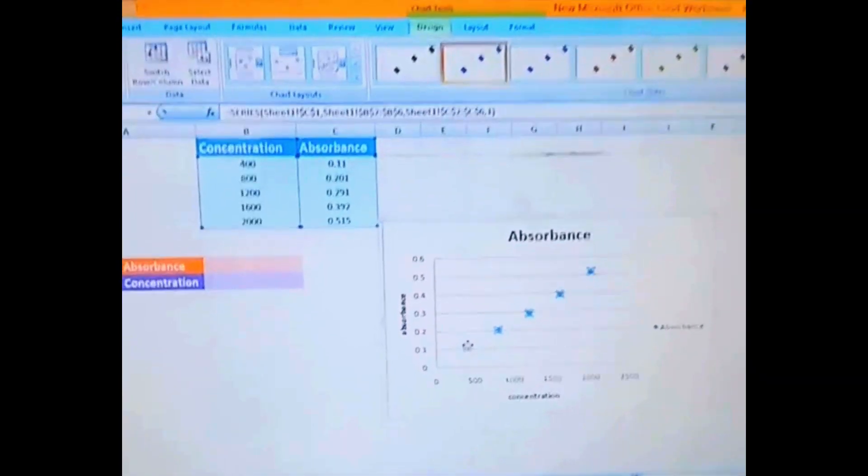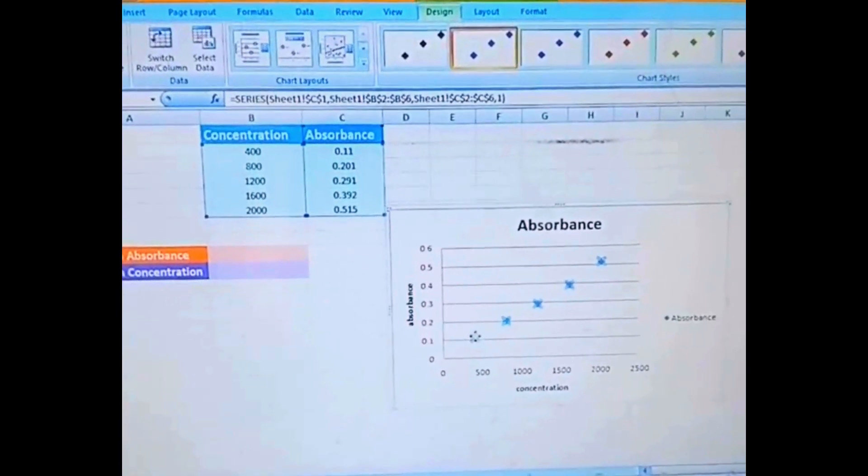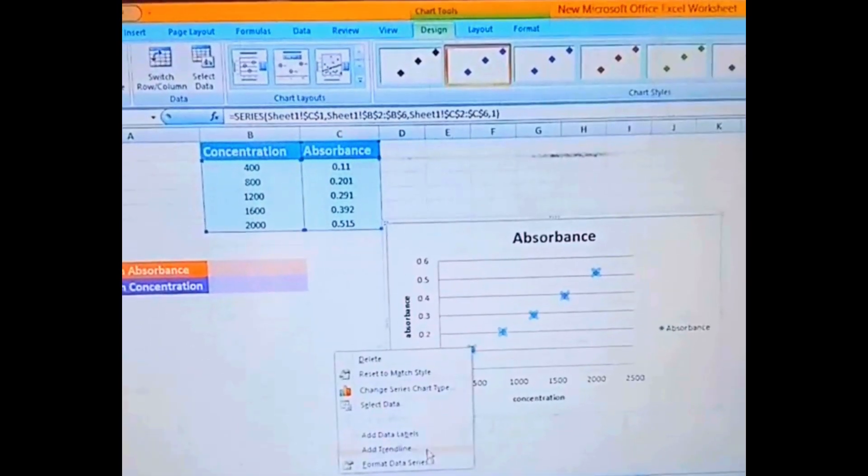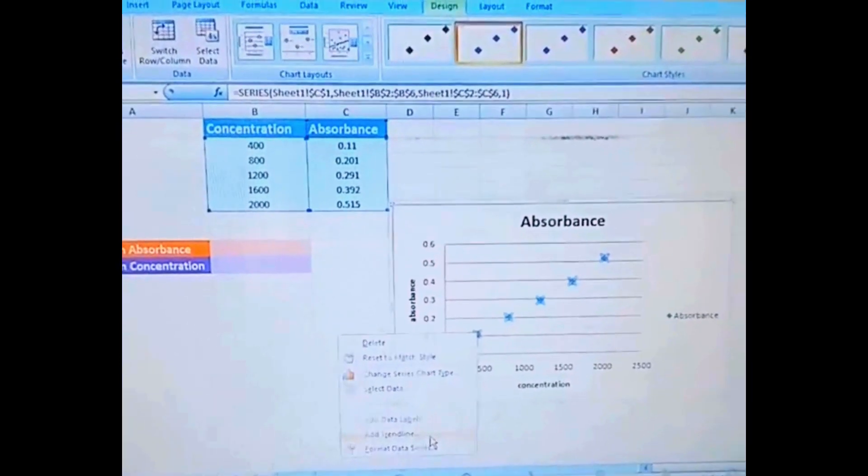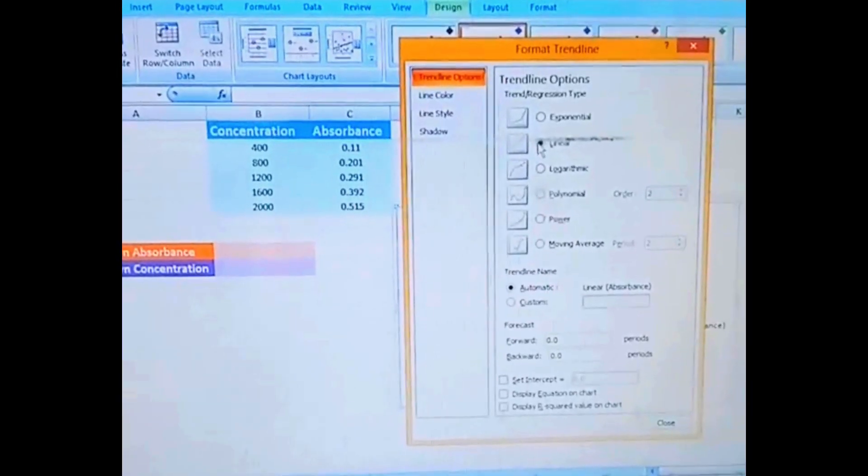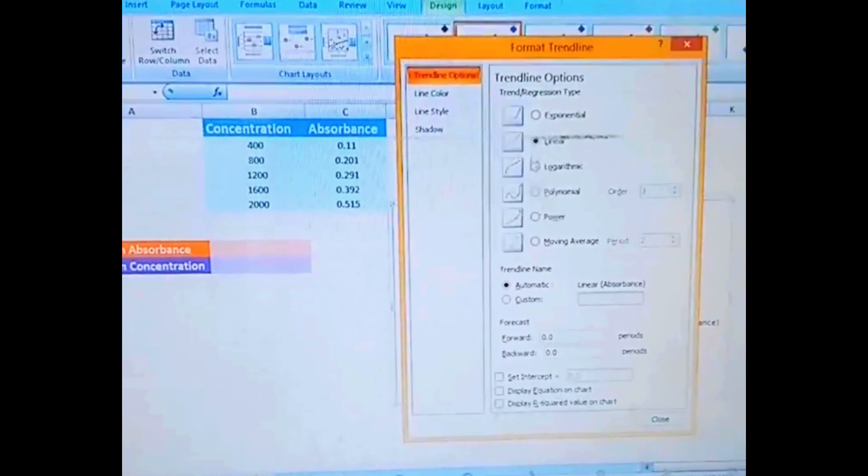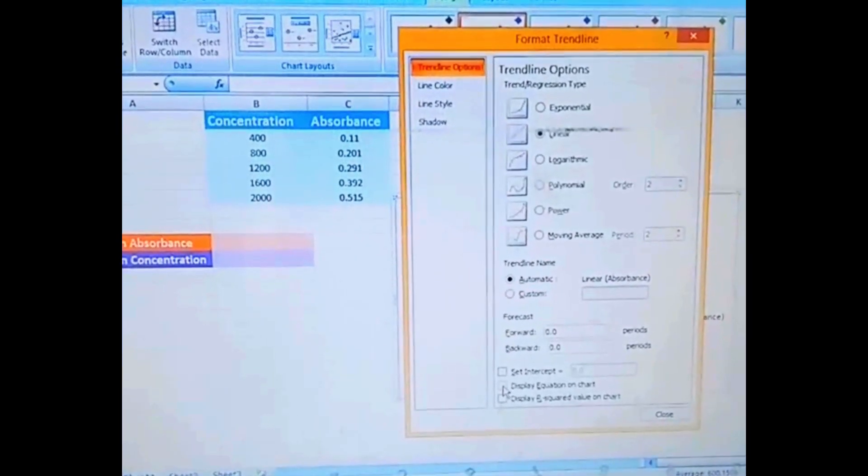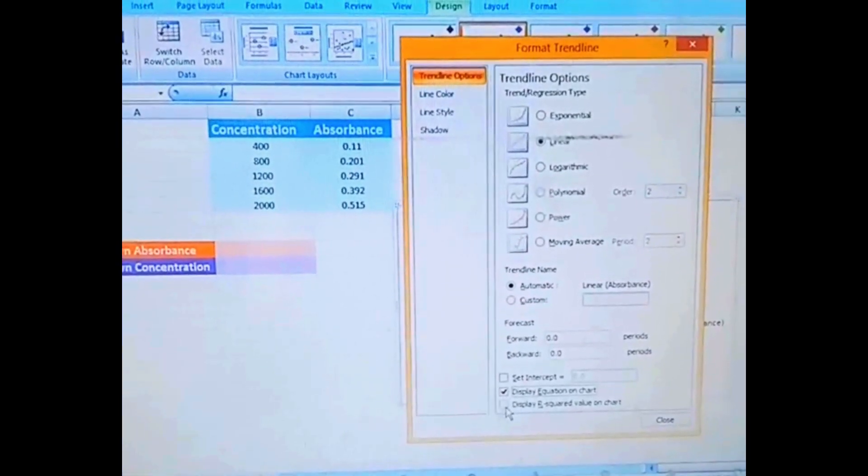Now I'm clicking on one of the dots and here we can see a trendline. Now here it should be linear and we are displaying the equation on the chart.